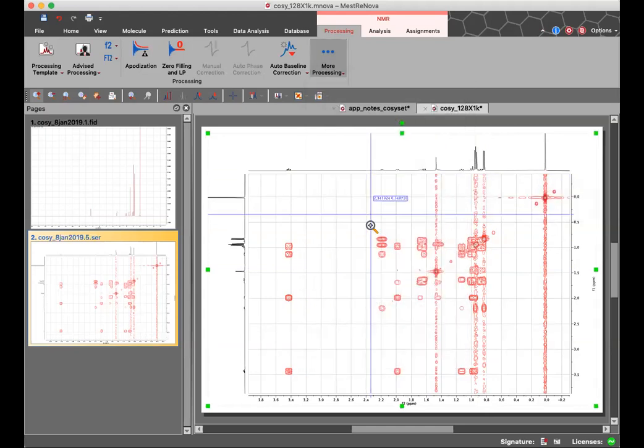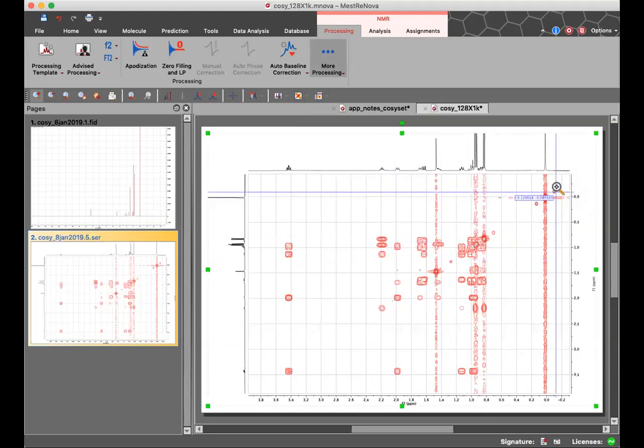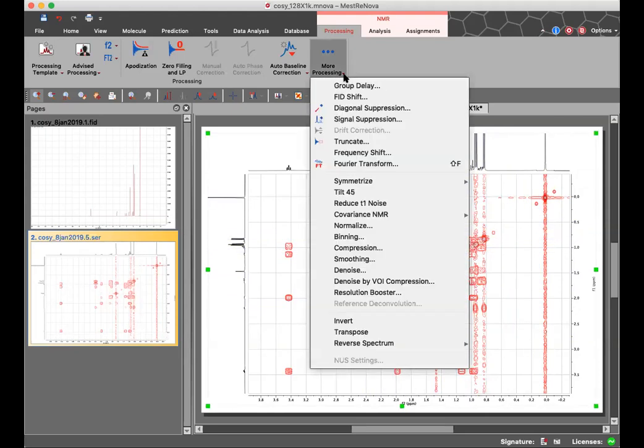Since the experiment is symmetrical about the diagonal, it goes through and only displays things basically that are the same on both sides of the diagonal. So that eliminates these ridges because it doesn't have a corresponding point on the other side. But it also kind of distorts the way the real peaks look. So if you try it, see how it looks for yours.